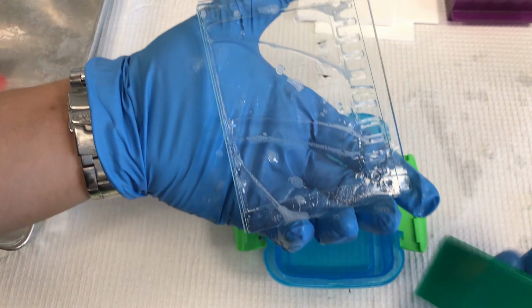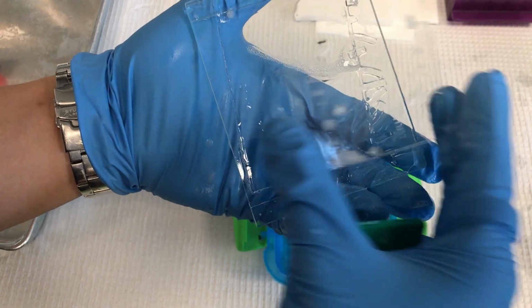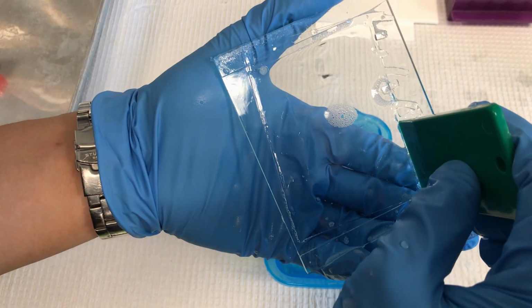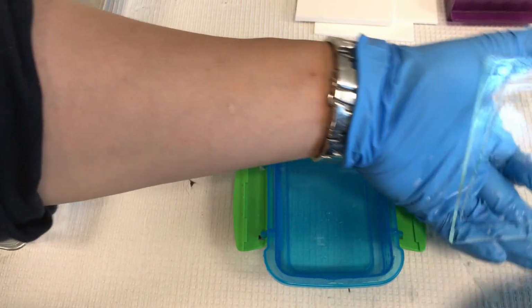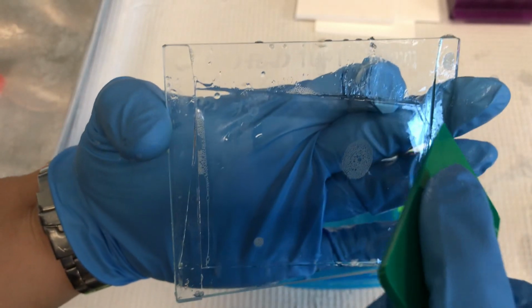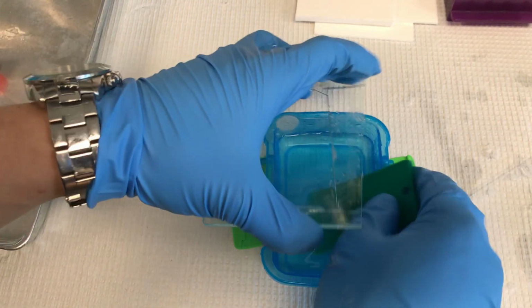Separate the glass plates using a plate separator. Okay, so you can see the gel. Remove and discard the stacking gel off the top using the plate separator. Cut the corner of the gel in the last lane and soak in transfer buffer.